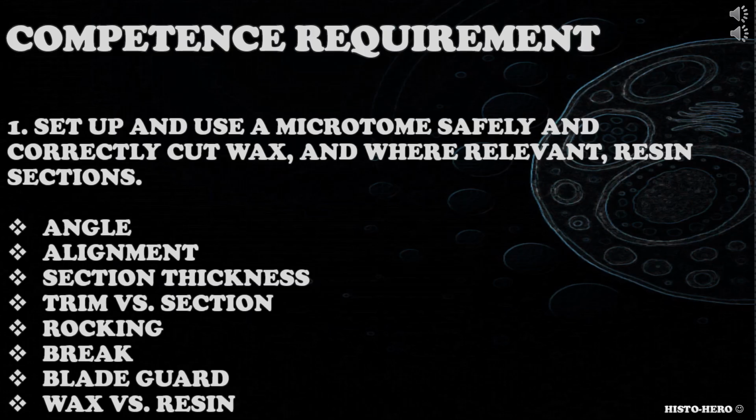When addressing this competence requirement, candidate could consider the angle, alignment, section thickness, rough trimming versus sectioning, rocking, brake and blade guard, difference between cutting wax and resin sections, and so on.